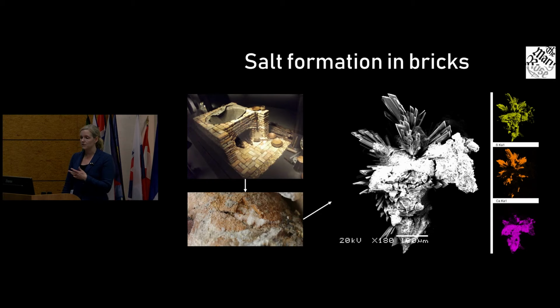These are SEM images that we took. This was a moment where I had to forget being a scientist, because when I first looked at these, I was like, wow, these images are beautiful. They're actually incredibly damaging for the material, so this is not good news, but they are beautiful images. And you can see that there's sulfur and calcium and iron there. We have done some SEM EDS analysis.